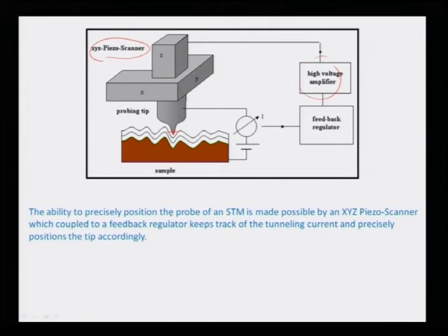So this kind of piezoelectric scanner is always coupled to a feedback regulator to keep track of the tunneling current, also precisely positioning the tip. Therefore, we need several electronics for such a device to run, and this all became possible only when the technology had advanced sufficiently.